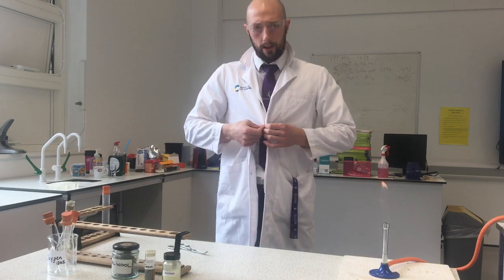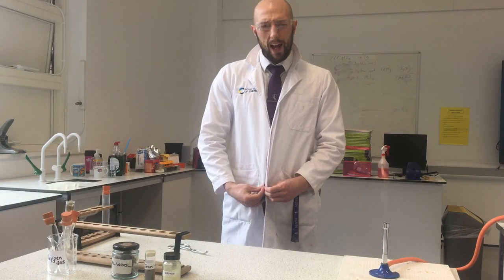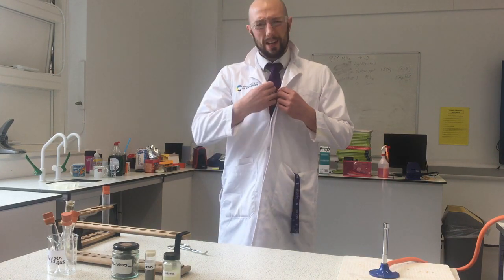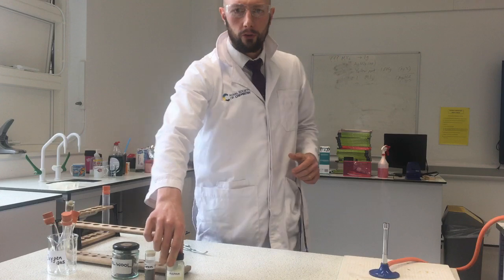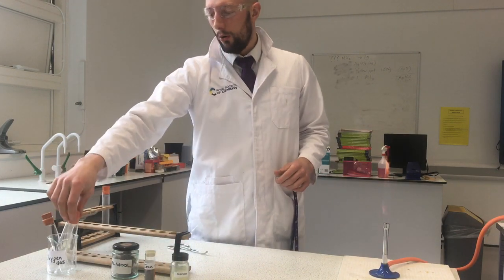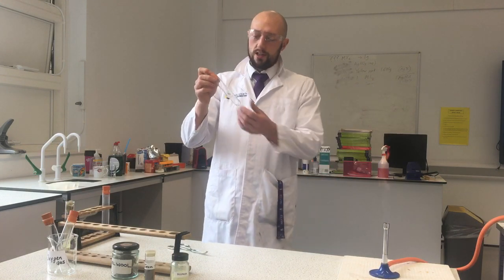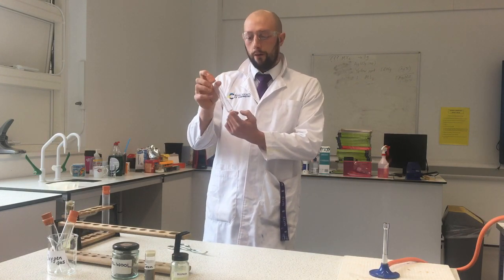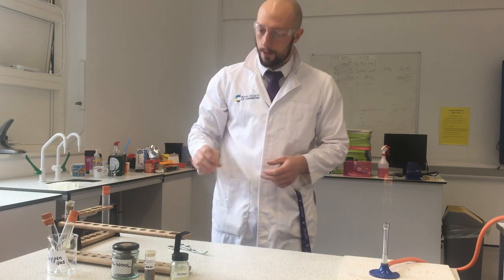Today we're going to look at the change in reactivity of a group of elements. So we've looked at the halogens, we've looked at the alkali metals. Today I'm actually going to look at group 6. So I've got some sulfur, which is group 6 period 3, and I've got some pure oxygen gas, which is group 6 period 2. For those of you that are interested, I made the oxygen gas by decomposing some hydrogen peroxide, which is something that you would find in bleach.